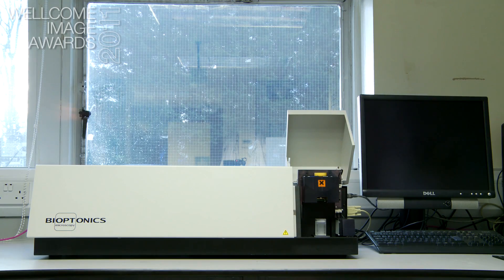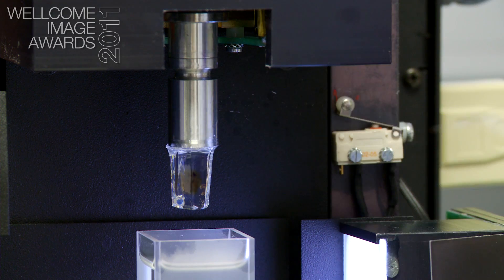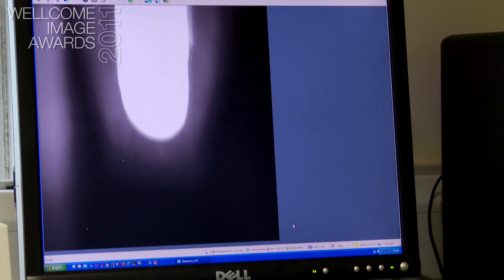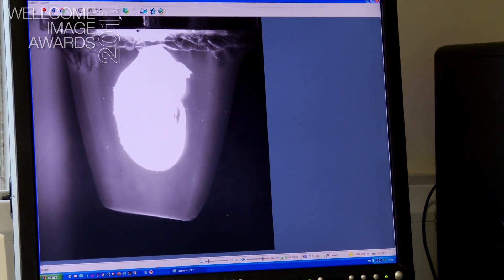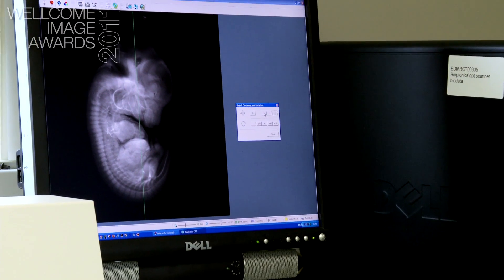This is the commercial version. Everything that you need is designed into the machine. The setup is very similar to the original homemade version and we have the magnetic plate for attaching the samples and for allowing them to slide around in order to get that position right.